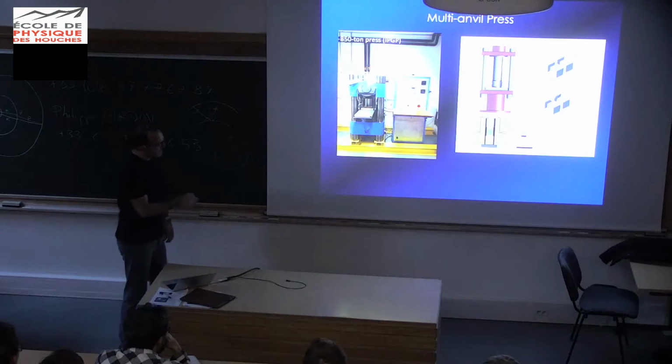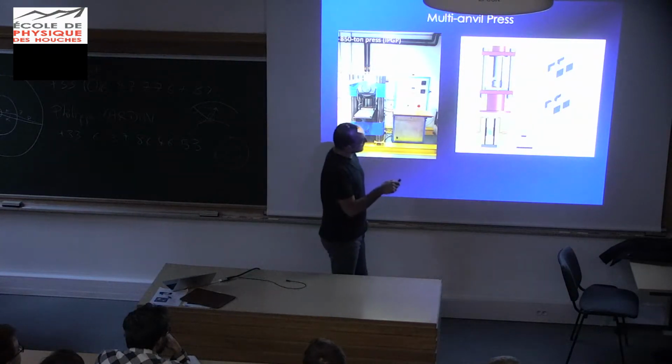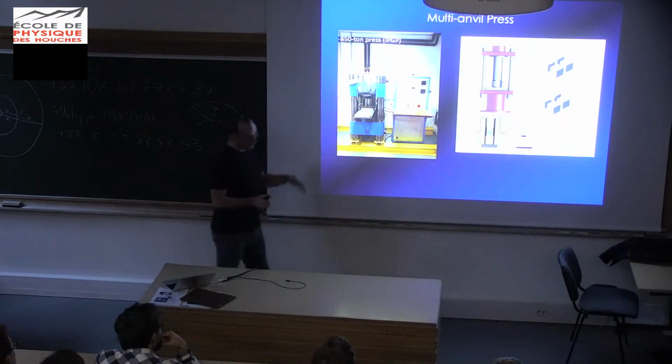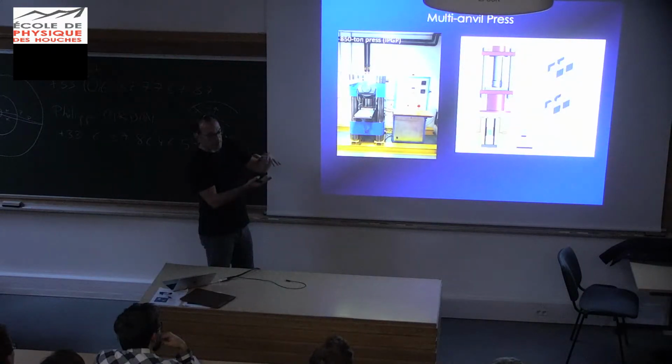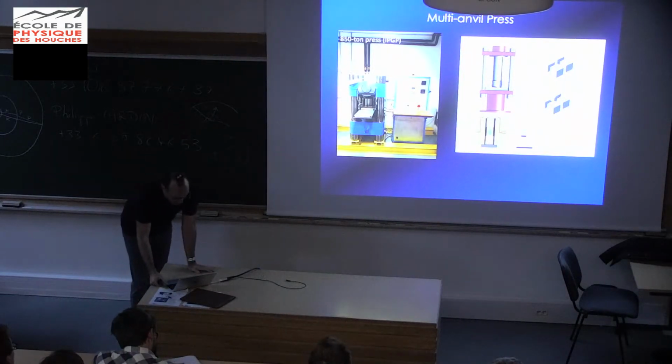So it's a very simple uniaxial press, and what you're doing is you're going to use this very smartly designed box here called a Walker hat box that is going to transform the uniaxial press into a multi-axial press, and that's why this is called a multi-anvil, because you don't have a single axis, you have multiple axes.